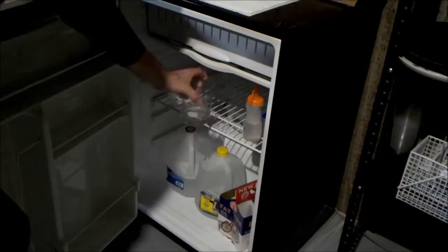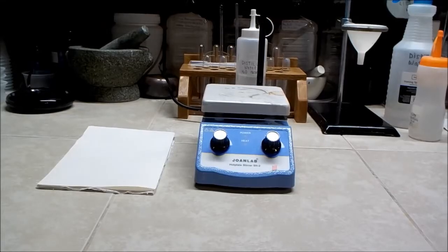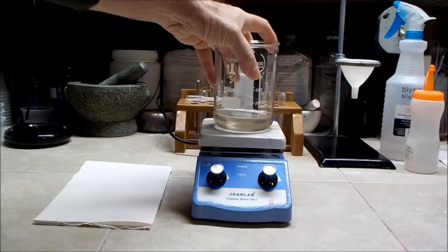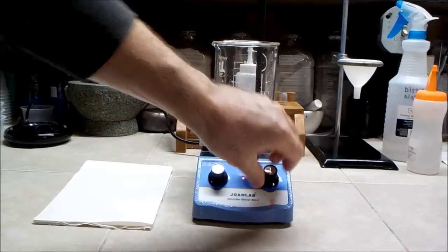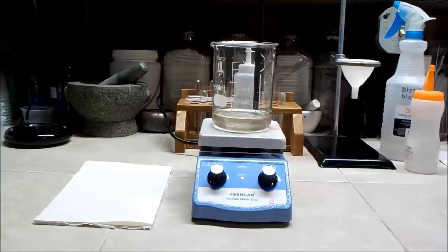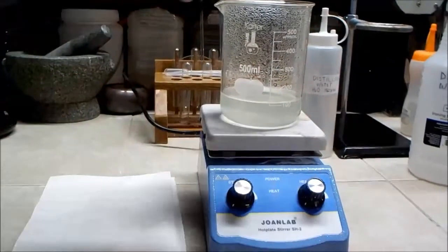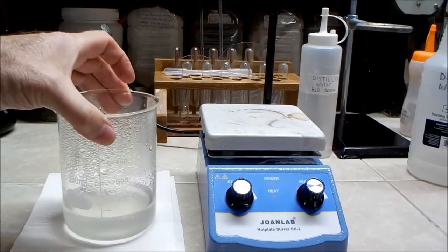Perhaps removing too much water causes this problem, because each alum molecule requires 12 water molecules to form a crystal — but that's just speculation. It could also be that there was simply no seed crystal to get the process started. So I warm the solution back up and add some more water to increase the volume. I also filter the solution again and am able to remove some more impurities. I set the beaker aside and allow it to cool back to room temperature.